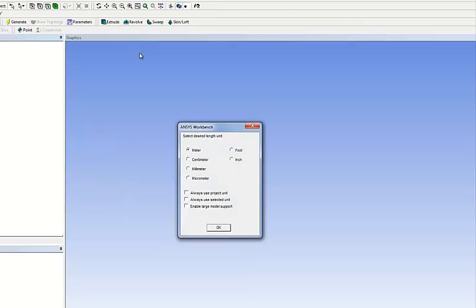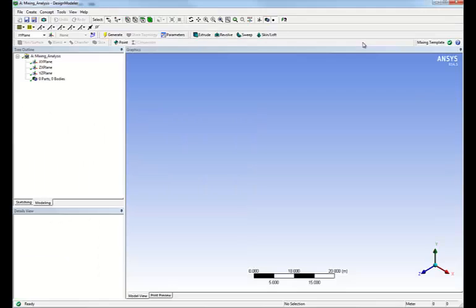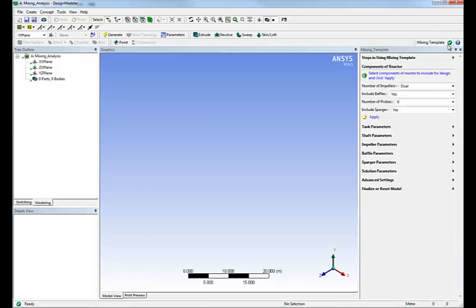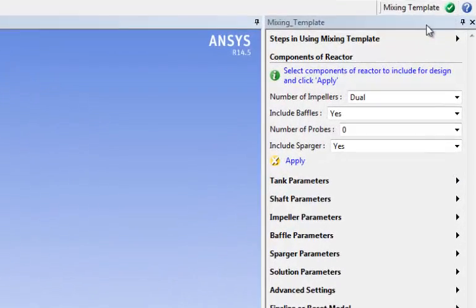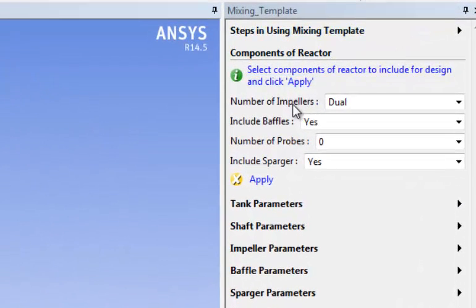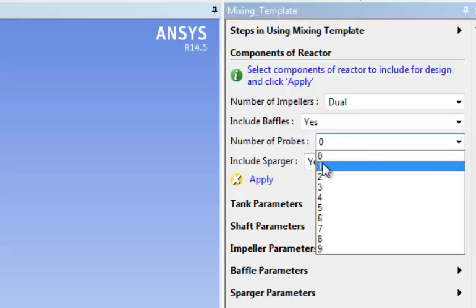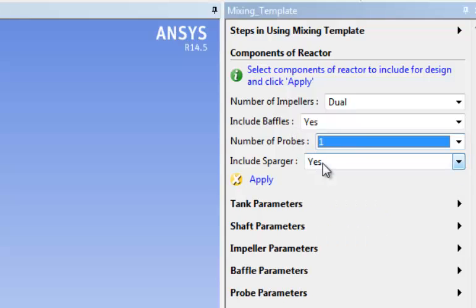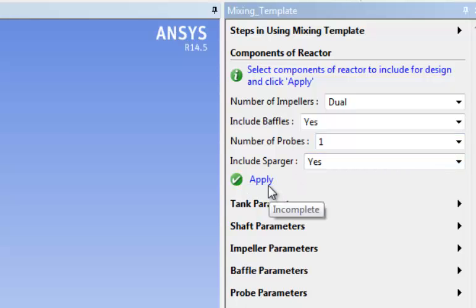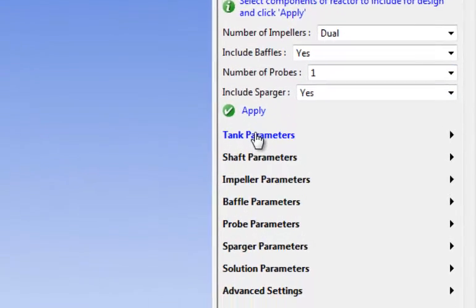Once I define the units, meter in this case, I will activate the mixing template. The first thing I will have to do is define the general characteristics of the mixing tank. We have two impellers, baffles, we'll have one probe and we'll have a sparger. We simply click apply.